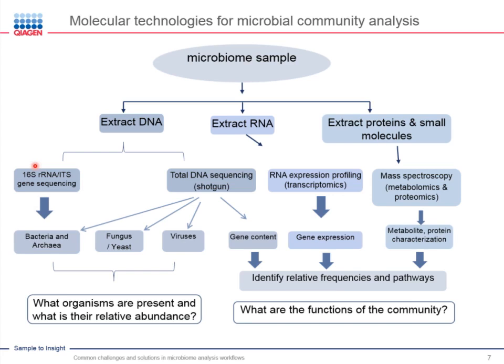The beauty of 16S sequencing is that you have a short amplicon, which is normally something like 300 base pairs when you look at the V3, V4 region, but still has a high discriminative power. So you can sequence this, have a low sequencing cost in the end, and can sequence a lot of samples and get your bacterial diversity, so your OTUs and the composition in your sample.